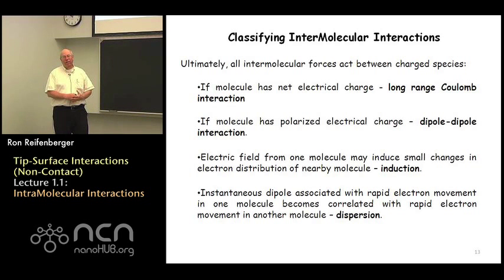We're going to systematically work through all these interactions. I think it's a worthwhile exercise to go through. It gives you a much clearer understanding of the nature of intermolecular forces, and the nature of these forces ultimately give rise to the interaction between a tip and a substrate that's relevant for atomic force microscopy.